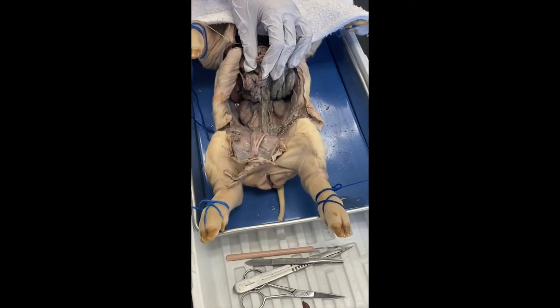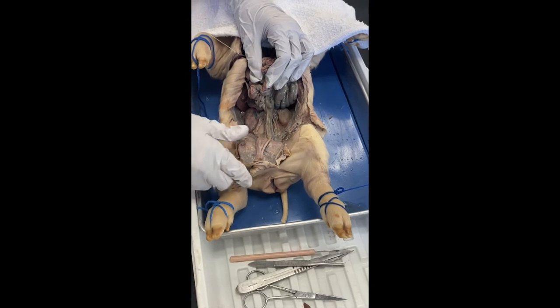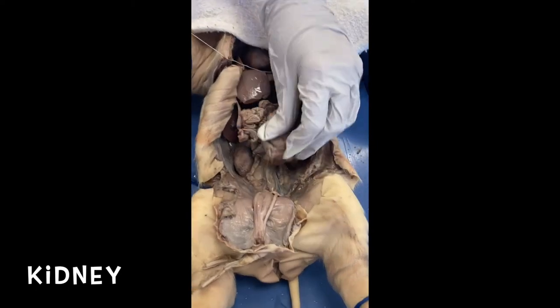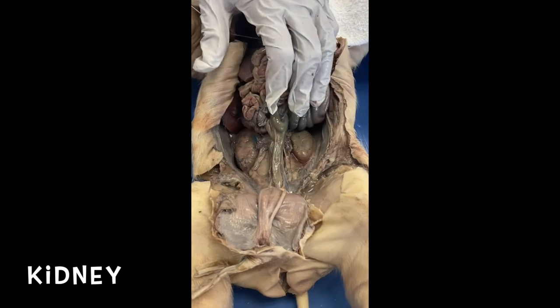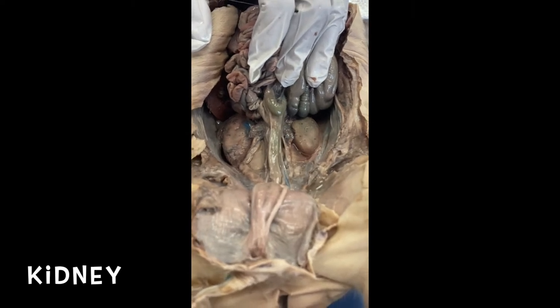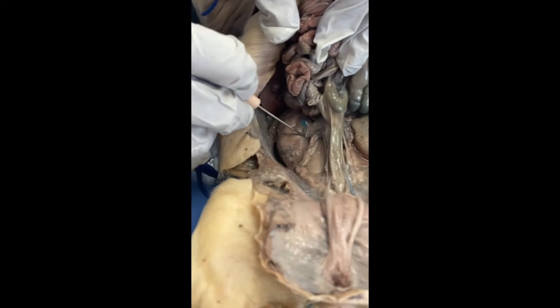All right, we're going to work on the excretory system. And I guess some reproductive because we're going to go into the testicles. But let's look at the kidneys. You probably can identify them here. Intestines up. We're on your back. I think that's why when people have kidney stones, it hurts. Is that right? Have you known anybody who's had a kidney stone? It hurts in the back because the kidneys are really at your back.